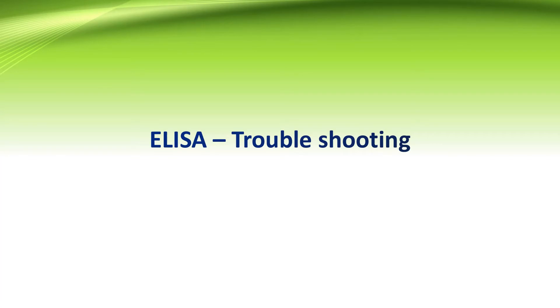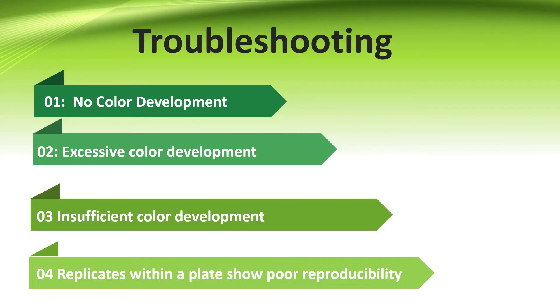While doing ELISA, we can encounter a number of problems which need a definitive solution. In troubleshooting, we will discuss various consequences which we can encounter during ELISA. It can be no color development, excessive color development, insufficient color development, or replicates in the ELISA plate showing poor reproducibility.